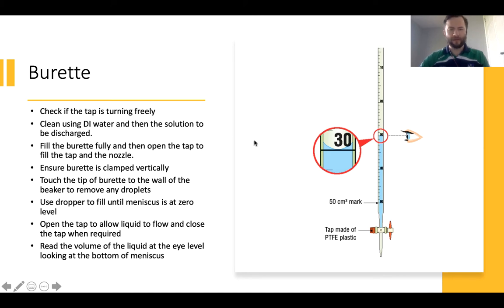First of all, you have to check if the tap is running freely, because some of the burettes have glassware taps which tend to stick. If they're stuck, it's important that the glassware is greased.